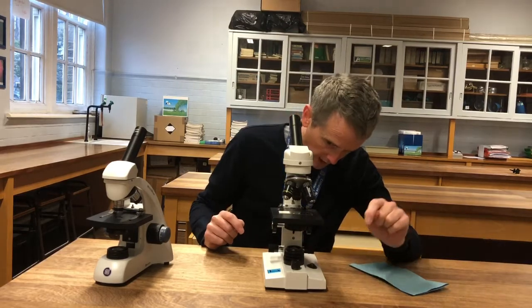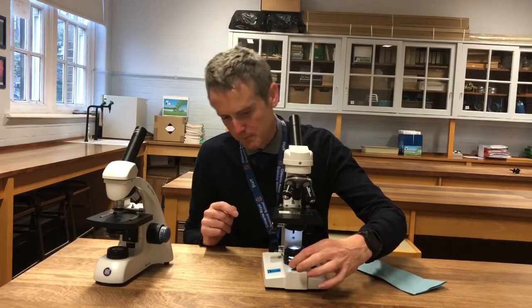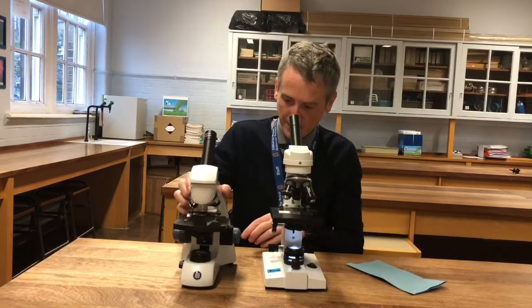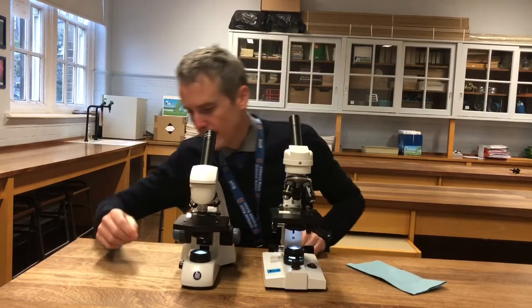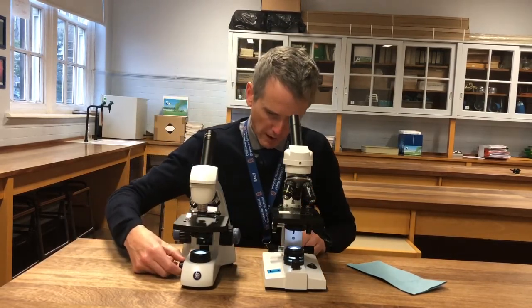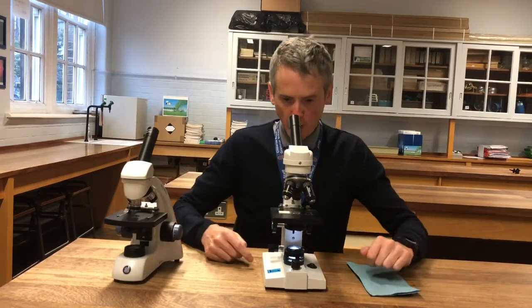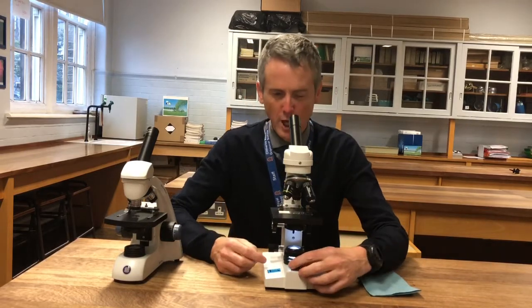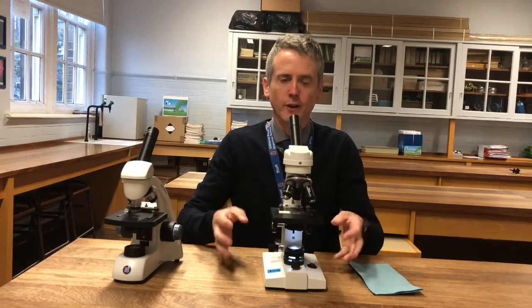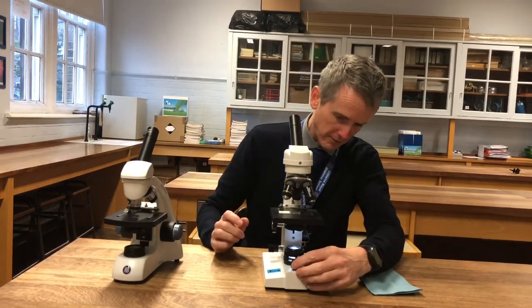I then turn it on — no light's coming through — but there's a dimmer switch at the front on this one to change the amount of light that comes through. This one similarly has an on button on the back and a dimmer on the side. You have to look around on the microscope to find where things are. When you're on low power, there's a wide hole in the lens, so it lets loads of light through — that's really bright — so I can turn it down.